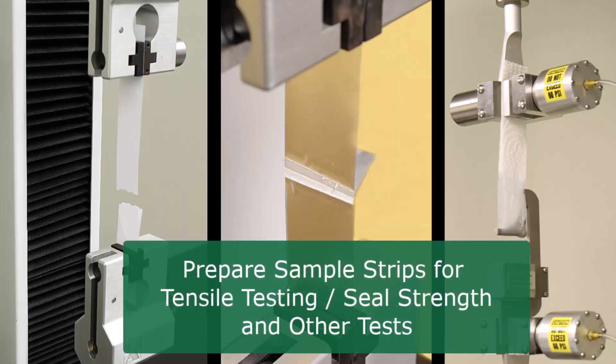Sample preparation is critical to testing results. The JDC cuts defect-free edges to ensure accurate test data.